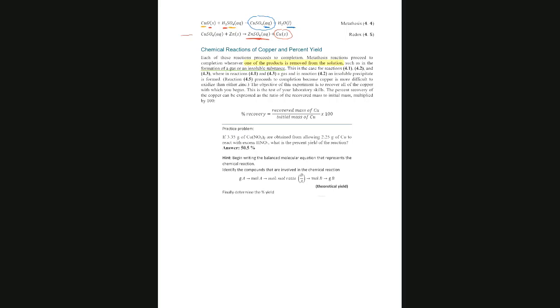In the procedure, when you read it, it says stop when there are no more bubbles.